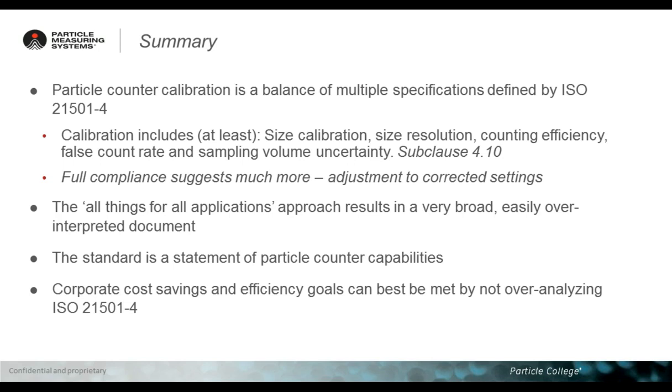Unfortunately, the calibration of a particle counter is not easy, as it can be for a pressure sensor or a temperature sensor, which only imply a single parameter to be tested. The calibration must include, and this is what you should always read on a calibration certificate: the size calibration, the size resolution, counting efficiency, false count rate, and sampling volume uncertainty.